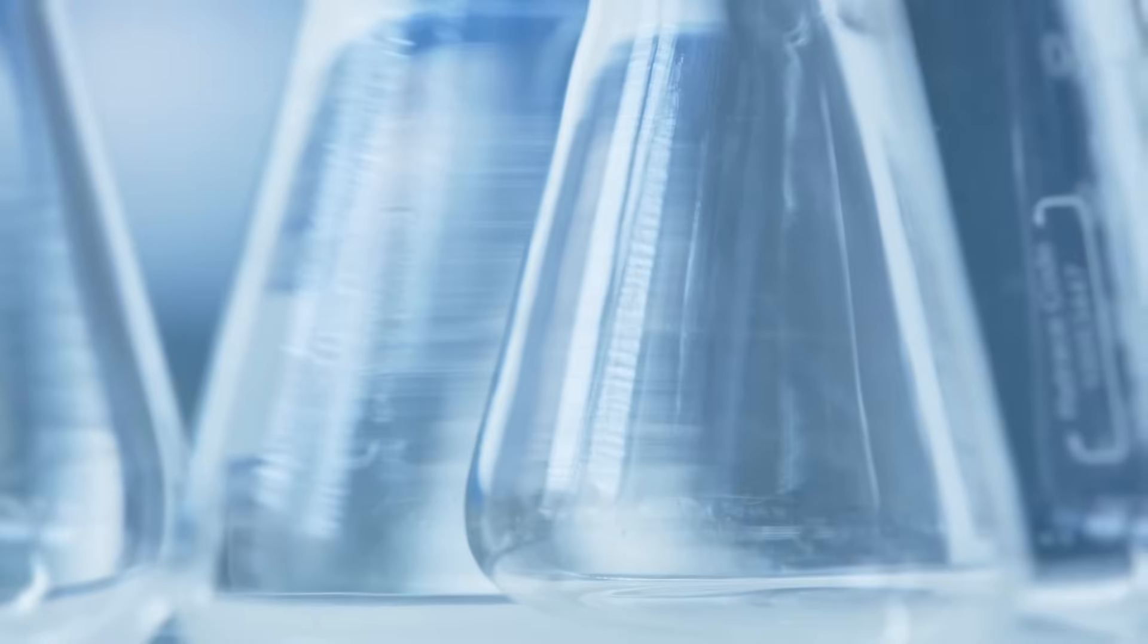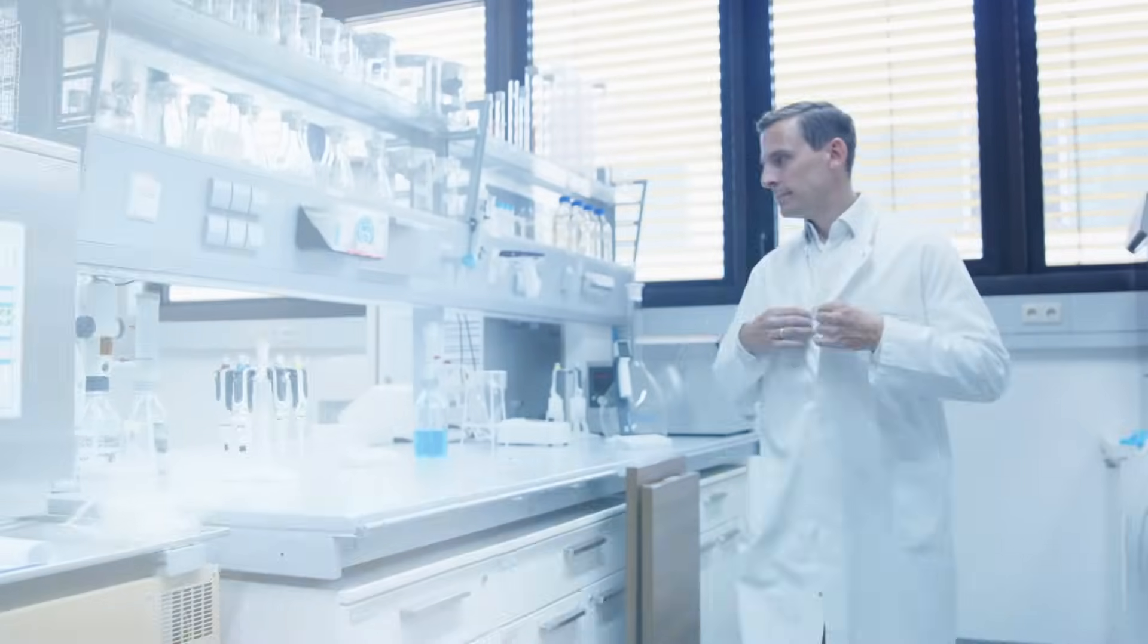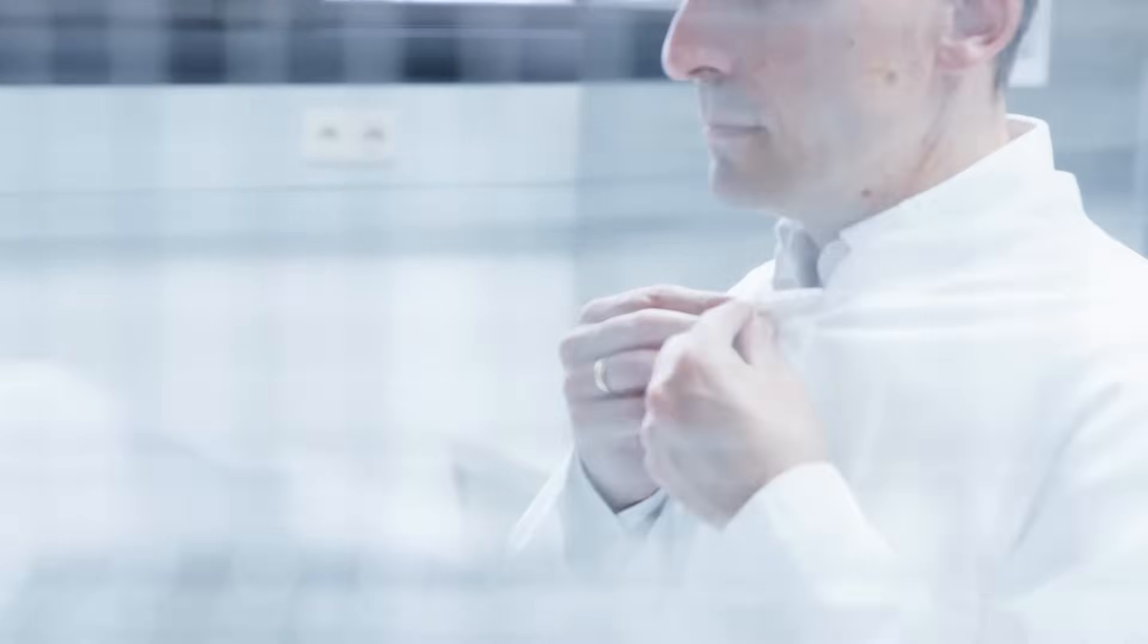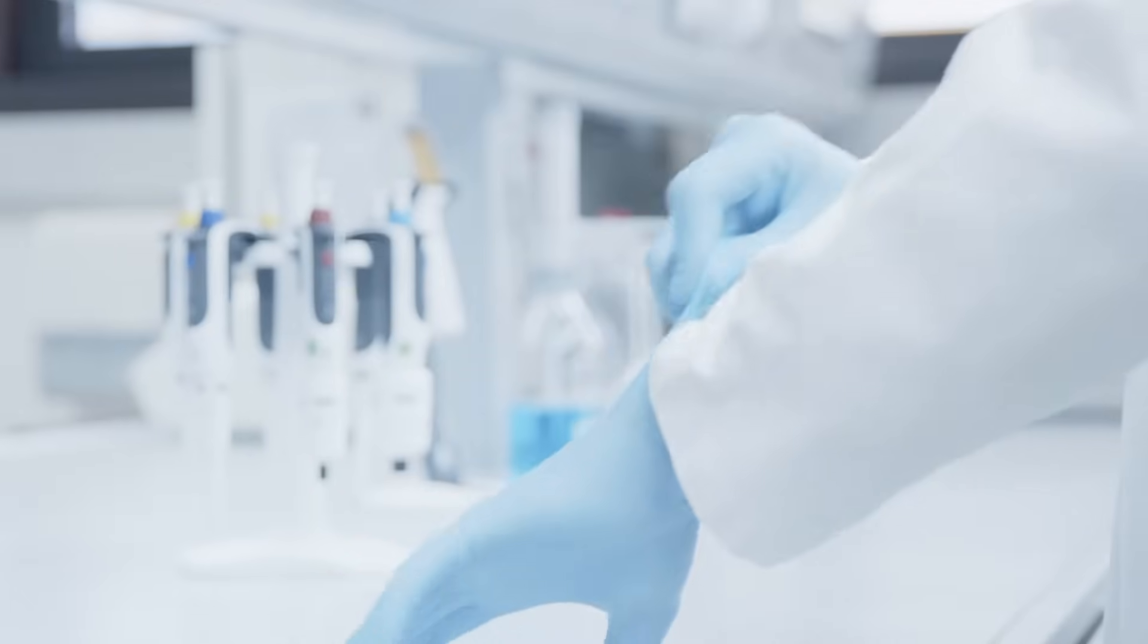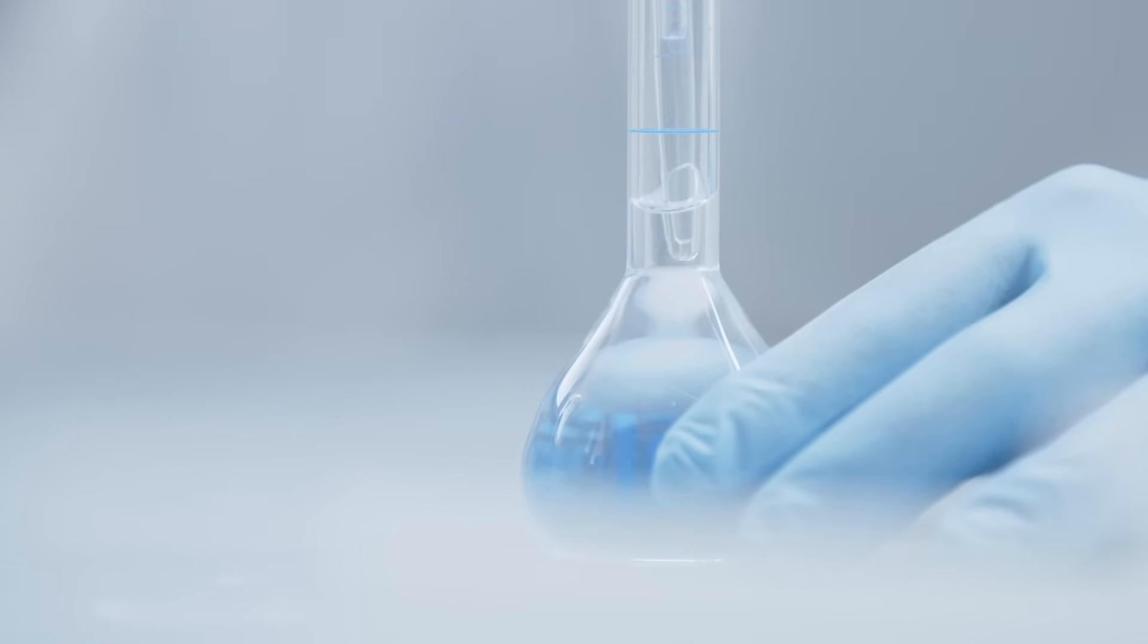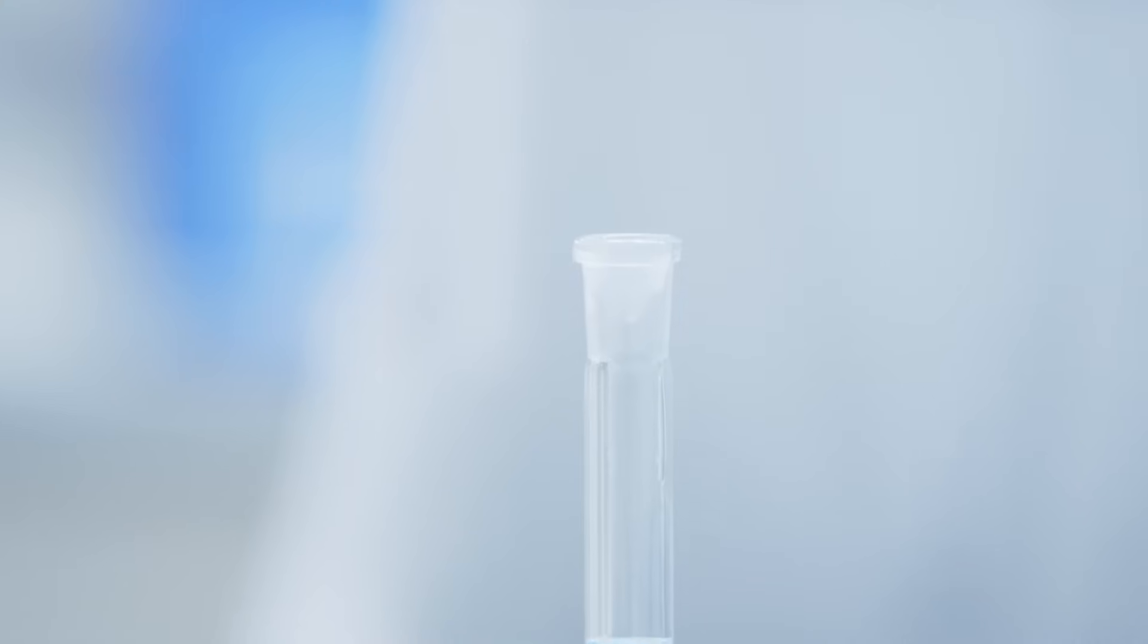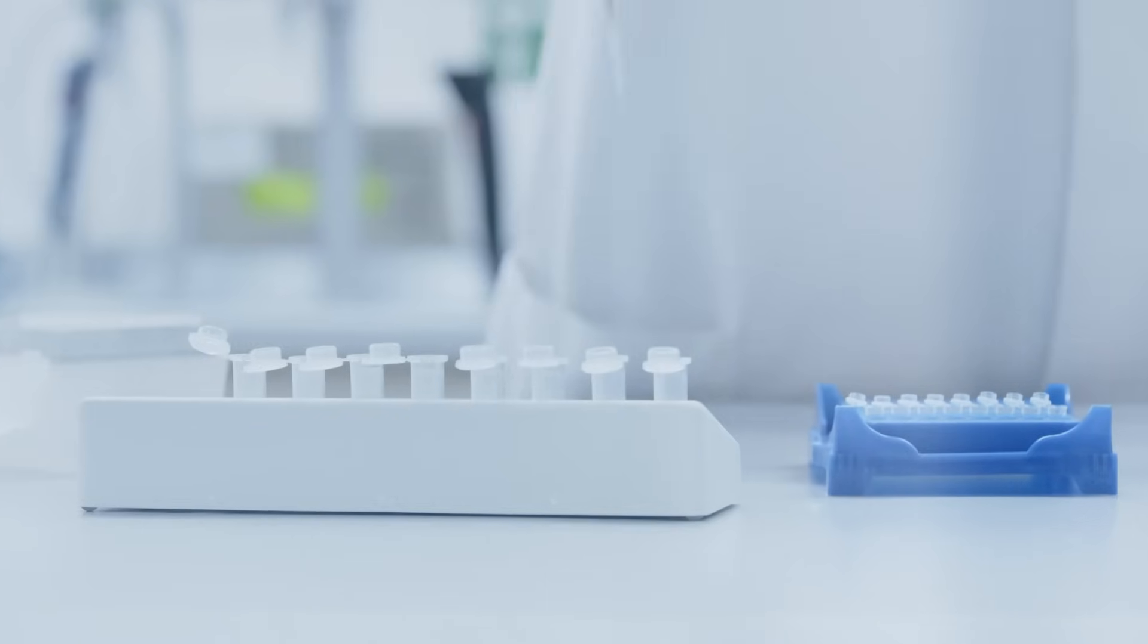Your tasks in the lab are challenging and complex. Your tools shouldn't be. At Brand, we aim to provide solutions that do not simply work but help make the work you do more simple, easy, and efficient for all liquid handling tasks and applications.